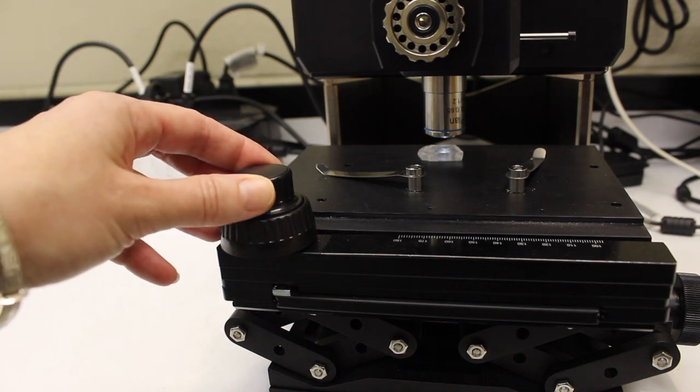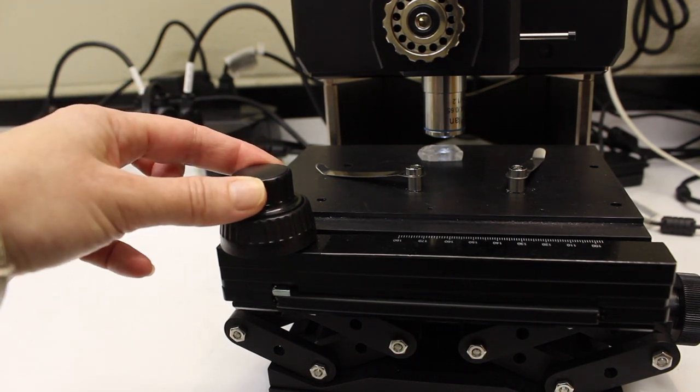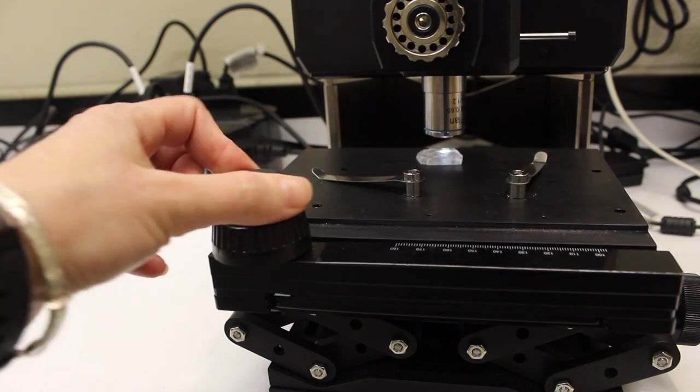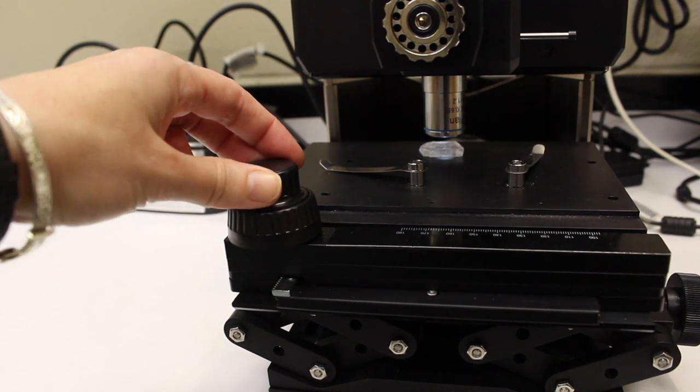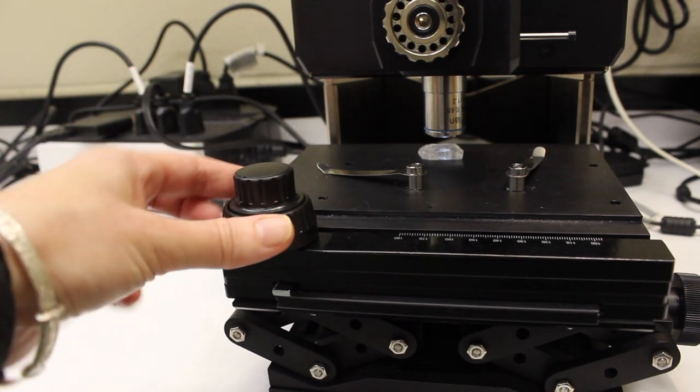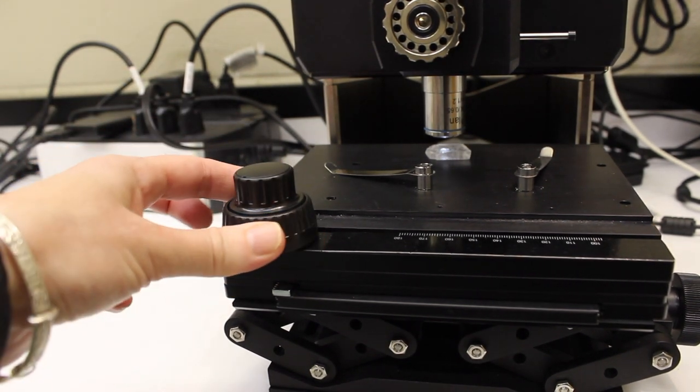To move the stage in the north-south direction, use the top knob on the stage. To move the stage in the east-west direction, use the bottom knob on the stage.